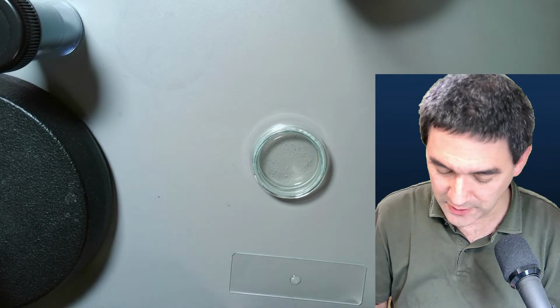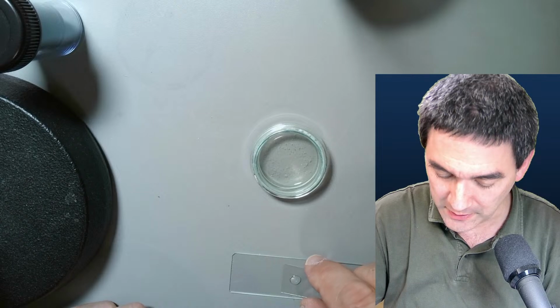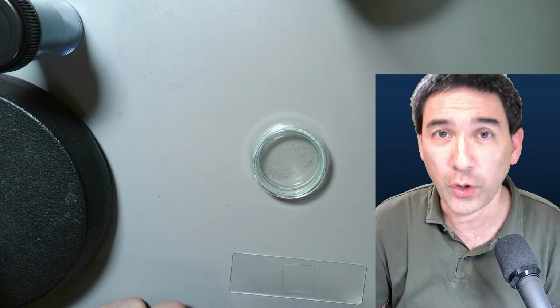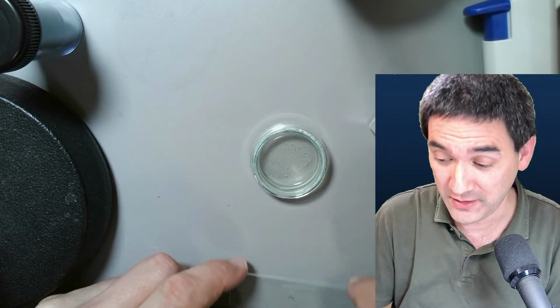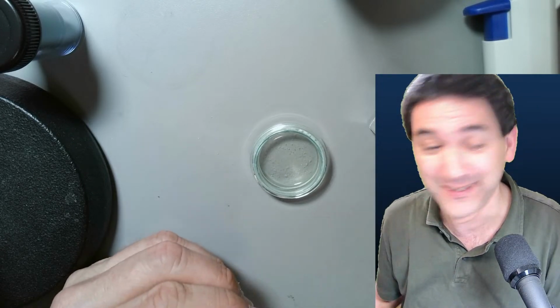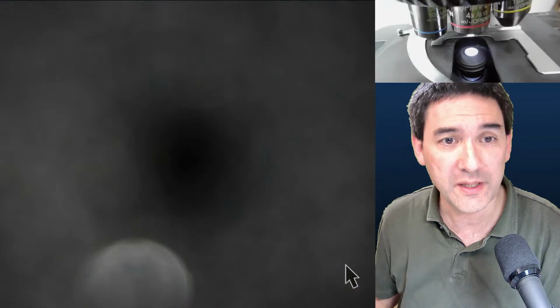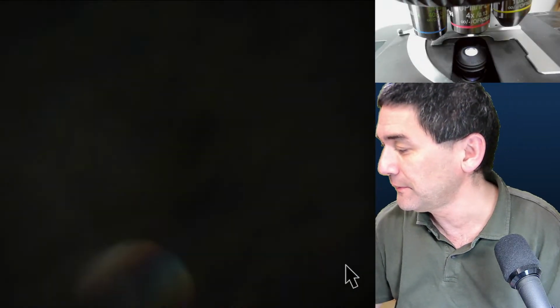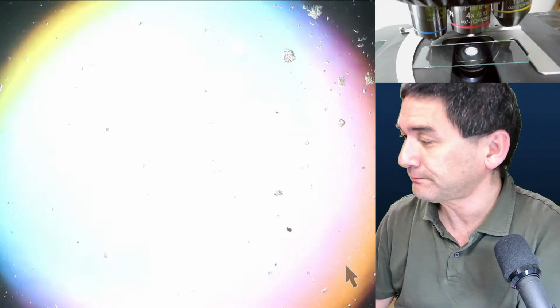Today, as you see, I'm doing a little bit of random stuff: Lego microscope, observing bacteria. I was actually hoping to get some Sahara sand from the air, which turned out not to be Sahara sand. That's another thing I would like to show you. So, and I have to find, as always, the thing here. Okay, and let's put those probiotic commercial bacteria under the microscope.